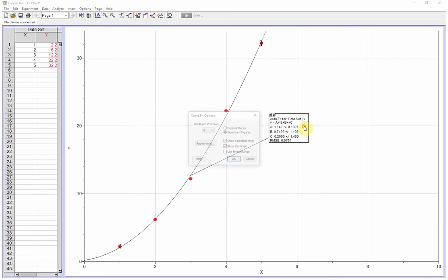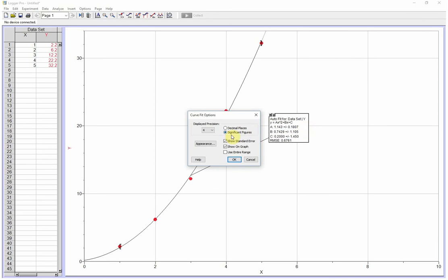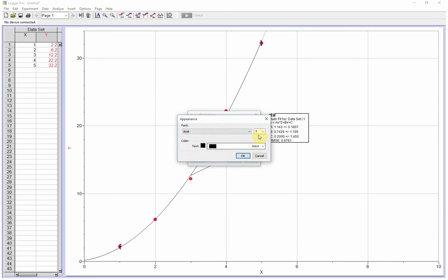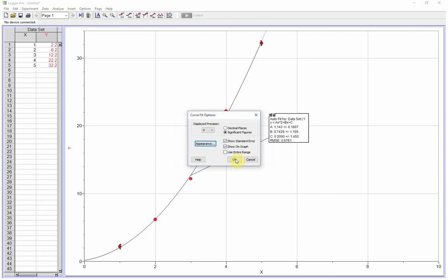Here's our equation, just like before. And we have, let's make this a little bit larger here so you can see it a little better.